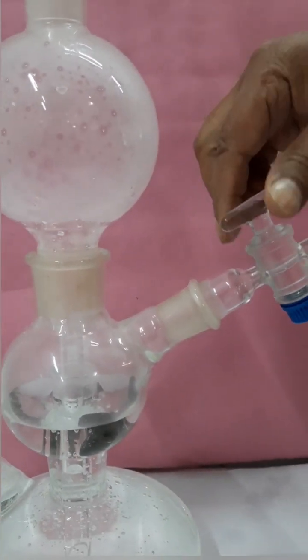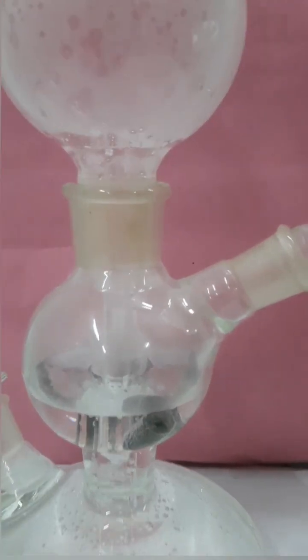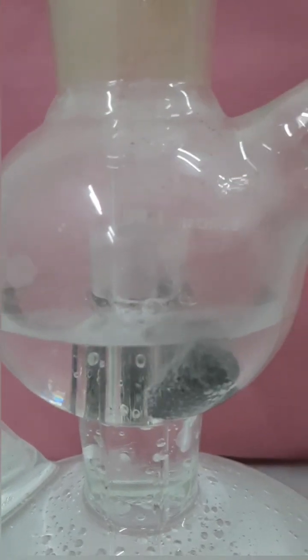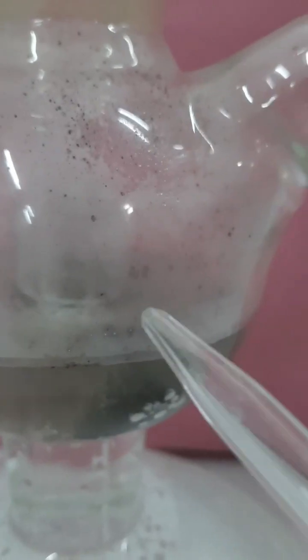You have to add enough dilute sulfuric acid to cover the ferrous sulfide present in the middle chamber. The reaction takes place in the middle chamber, where the ferrous sulfide stick reacts with dilute H₂SO₄, leading to the formation of H₂S gas.